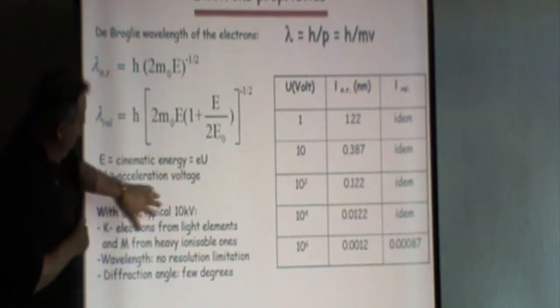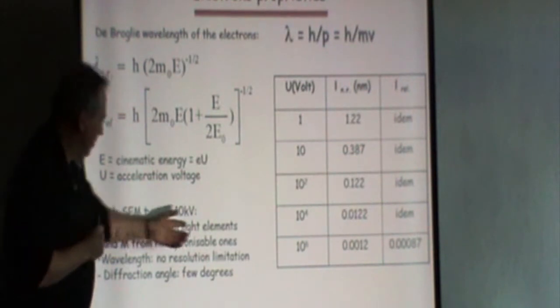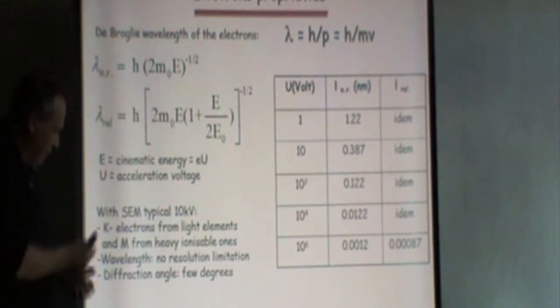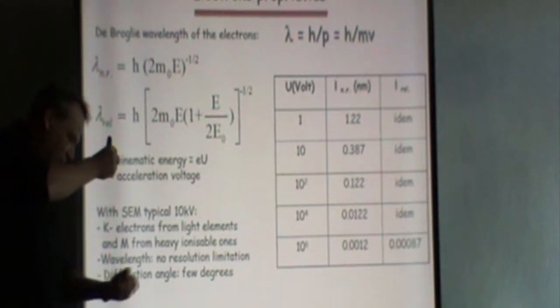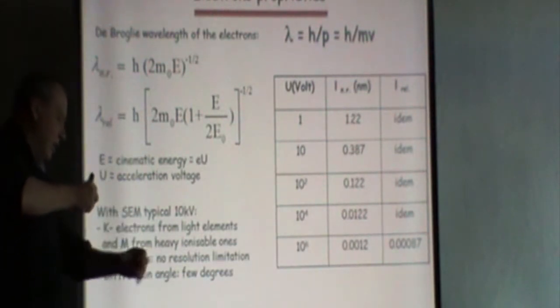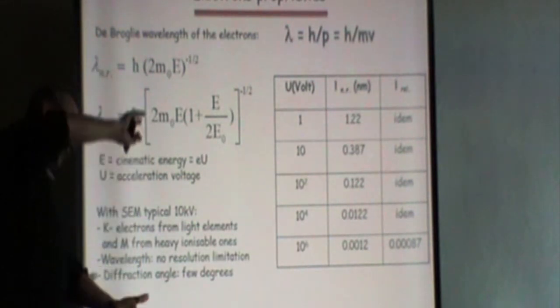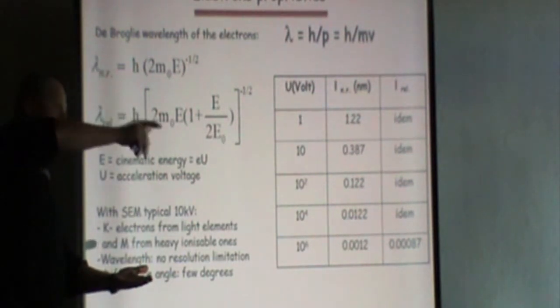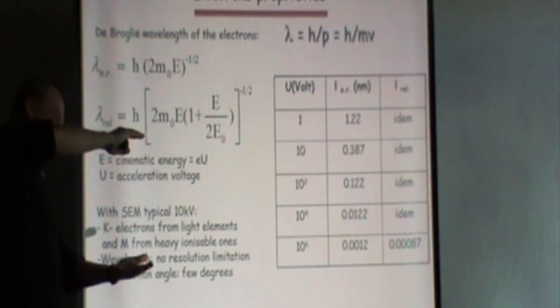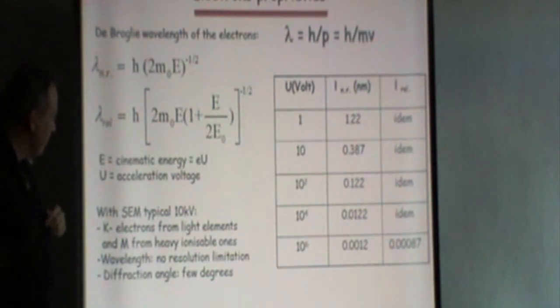If you think about the energy, though, so if you do later analysis, it means that if we have light elements and we hit them with an electron of this energy of 10 keV, we can kick out electrons from lower shells, from the K shell, you know, you have K, L, M, and so on. So you take out an electron here, and then we can get an electron down to this level, and the energy difference is very characteristic. Very characteristic. And therefore we can use this for analysis of our sample, for chemical analysis.